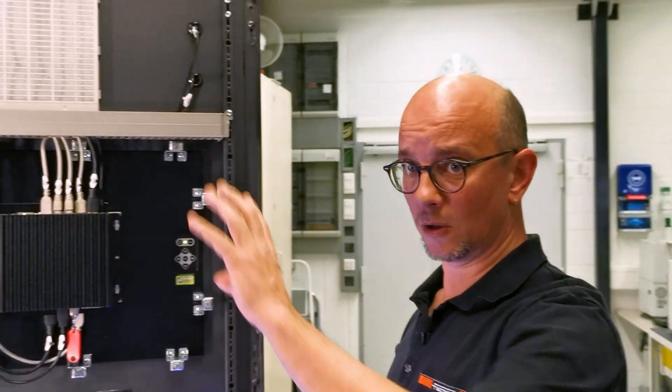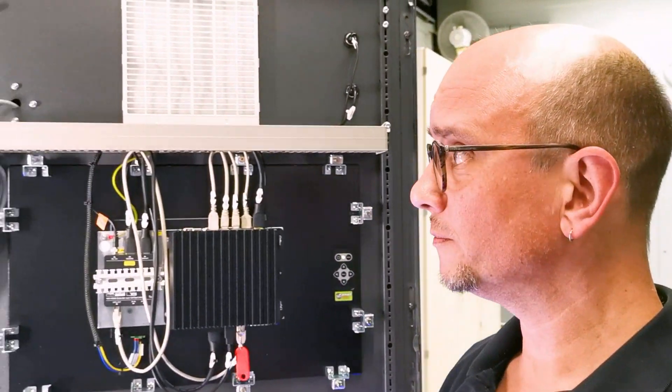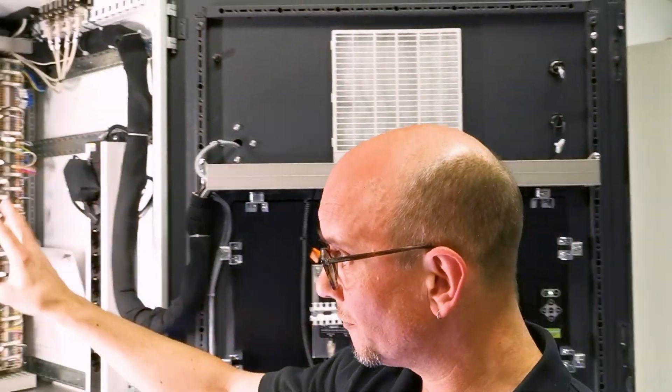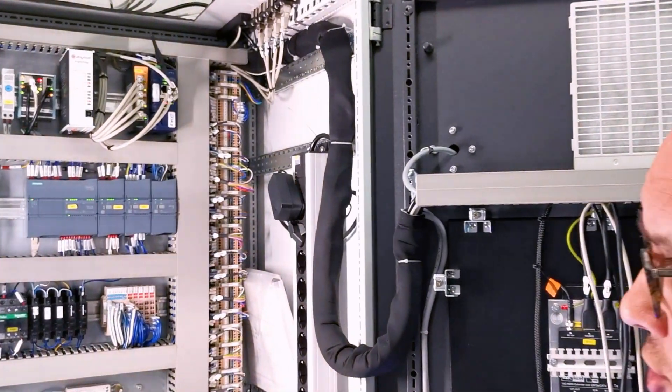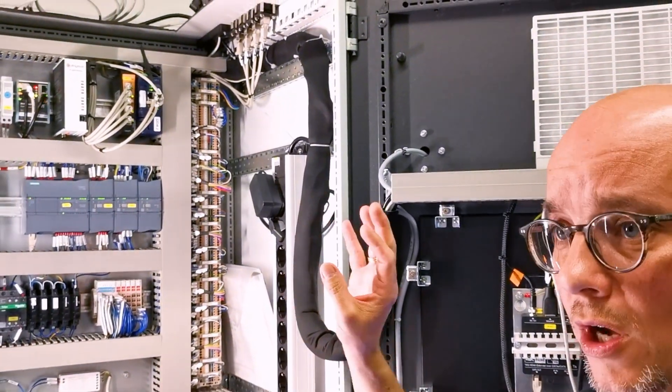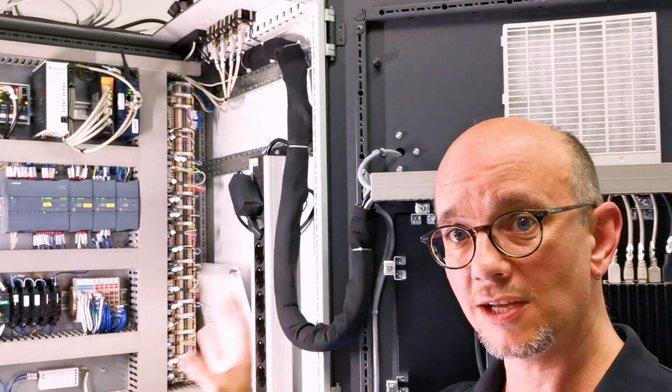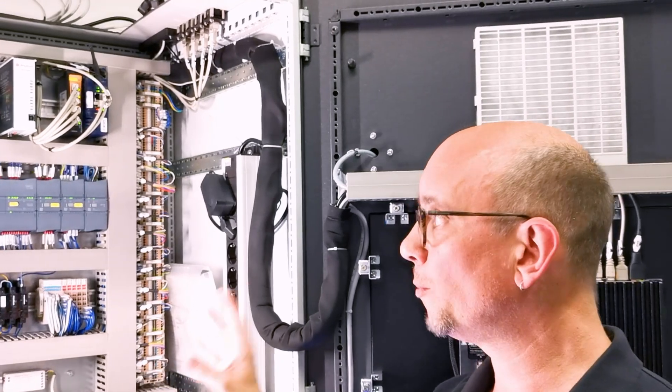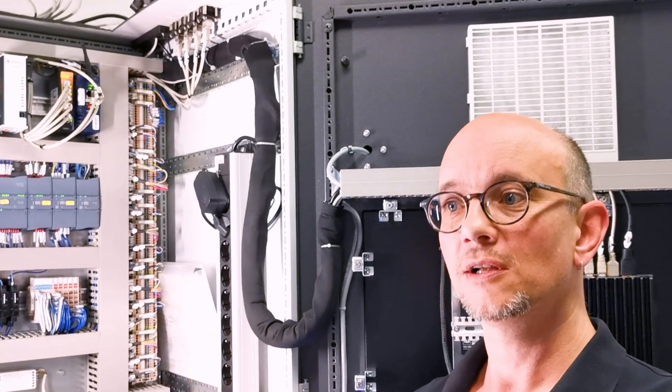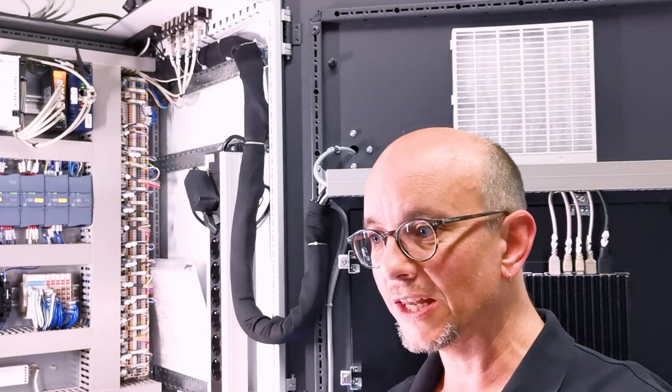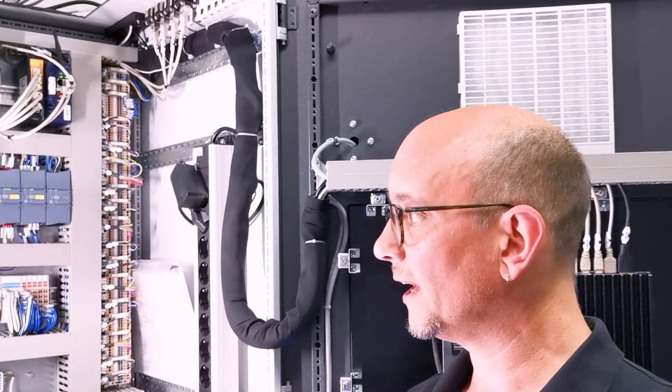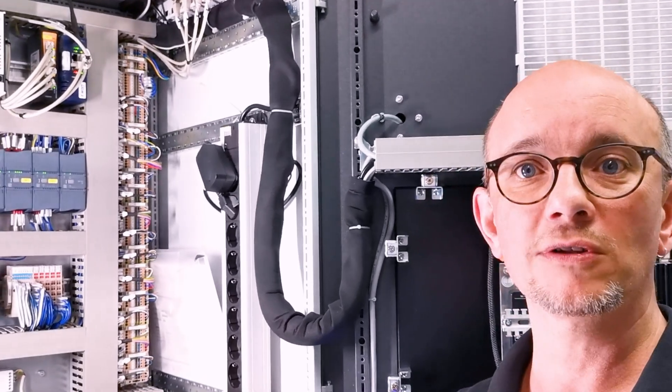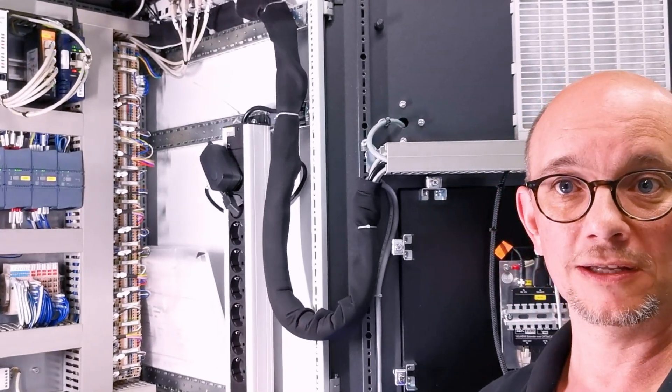So let's quickly have a look at the inside to get an overview. On the upper section of the cabinet, we have the electrical installations. We are using industrial-grade components available all over the world and with a very long time availability.